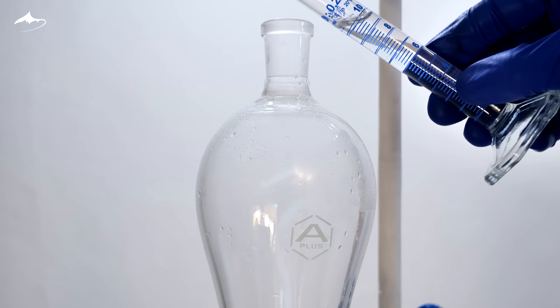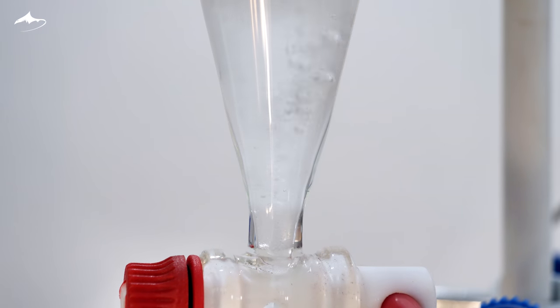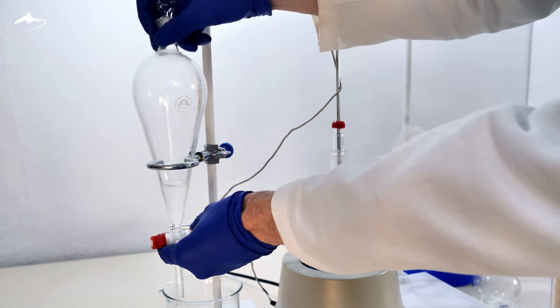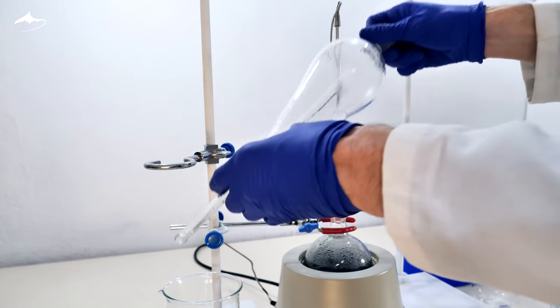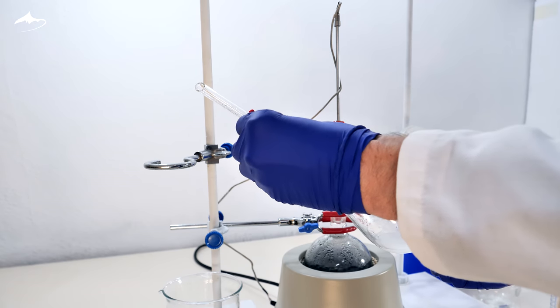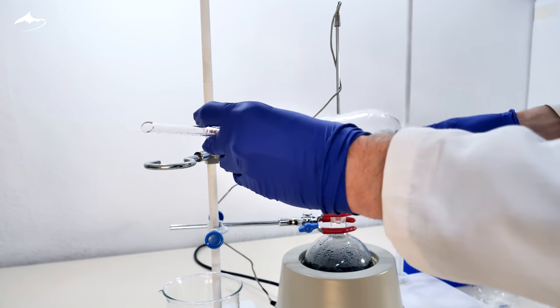Then, the organic phase is washed three times with saturated sodium chloride solution. For that, the funnel is stoppered and shaken gently first and vigorously after while opening the stopcock to release any pressure that may have built up inside.